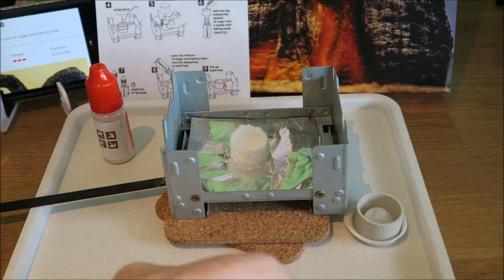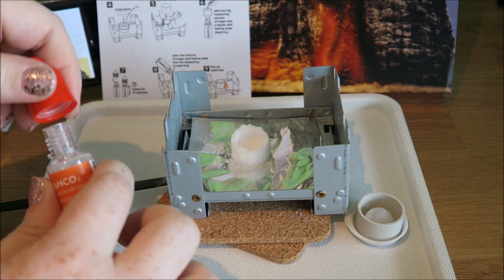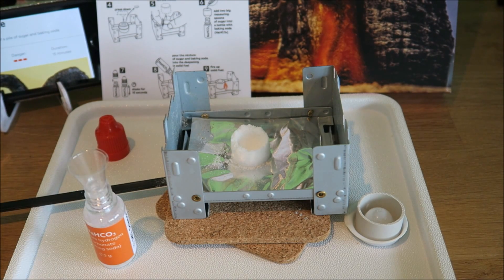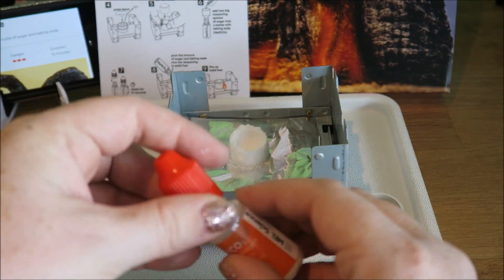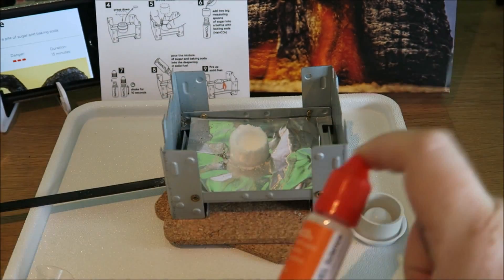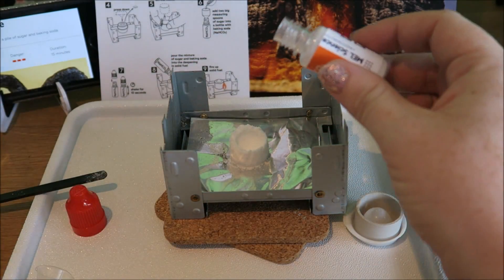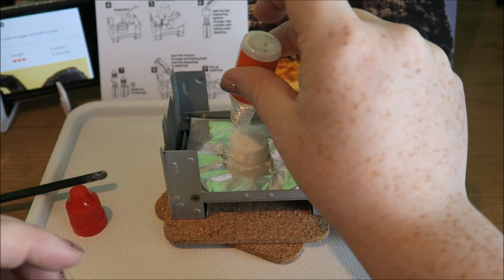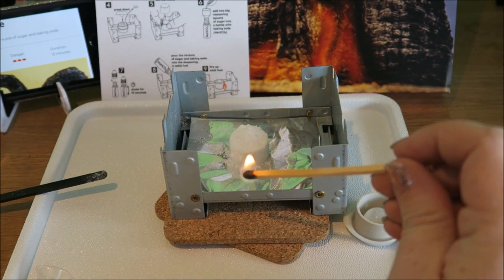Ta-da! Now we have our sodium hydrogen carbonate. Our little measuring cylinder, and it wants two scoops of sugar. Put the lid back on, shake. This now gets poured into our little mold of fuel.